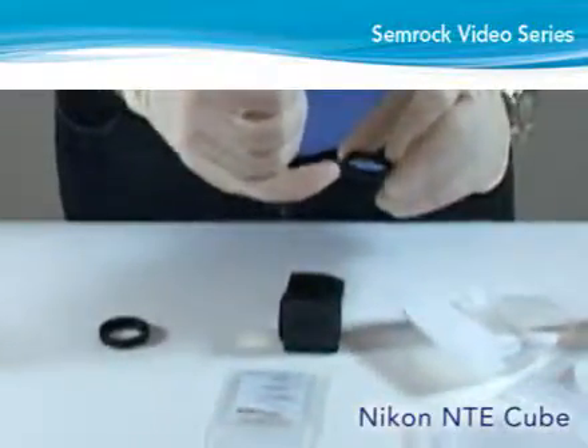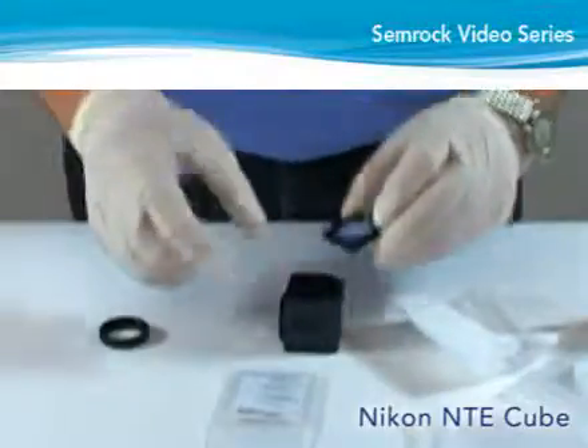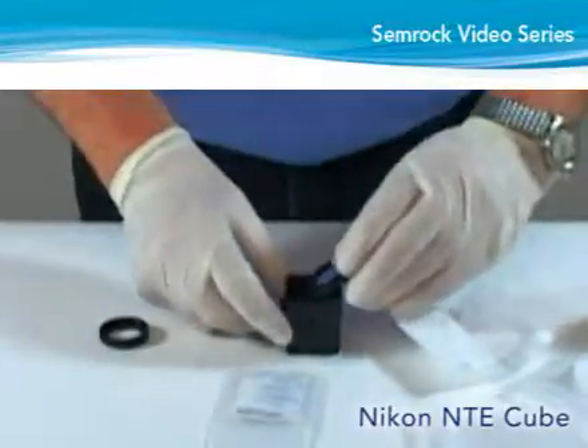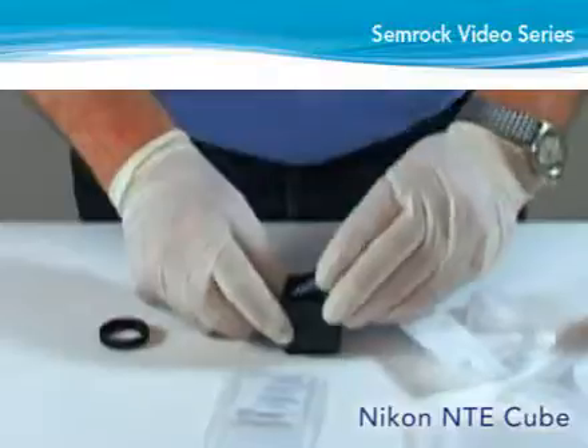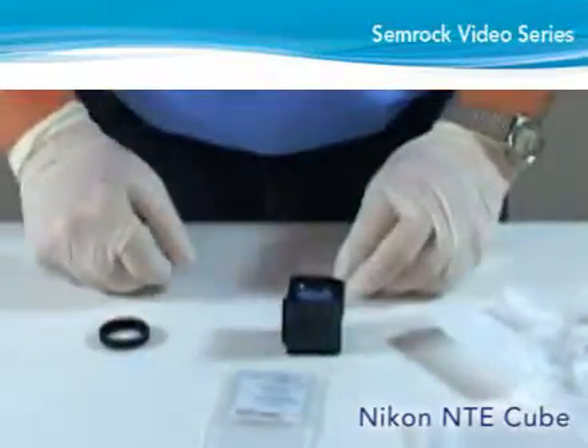Position the emitter housing over the dichroic retainer such that the two locating tabs on the emitter housing fit into the holes in the cube. Squeeze the locking lever inward and press down on the emitter housing to lock it into place.